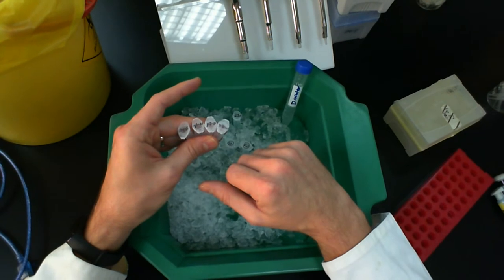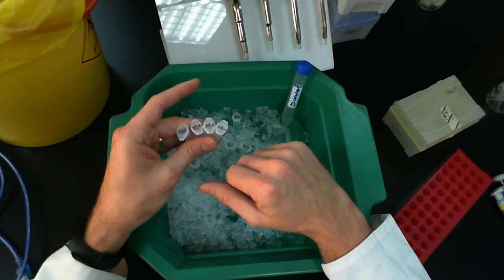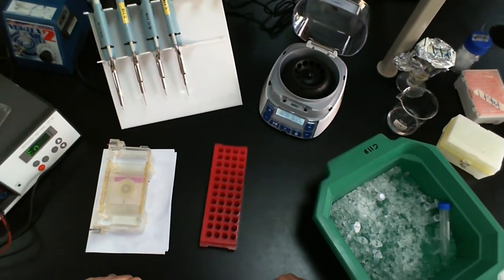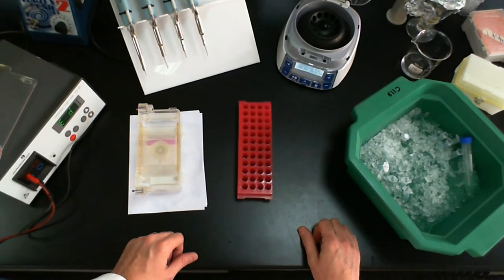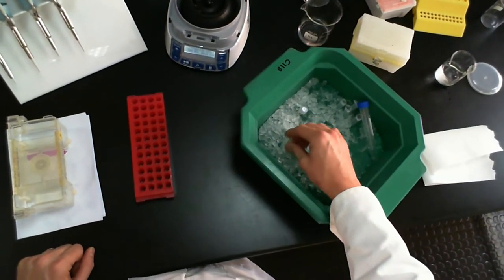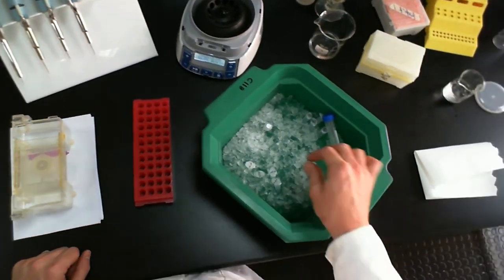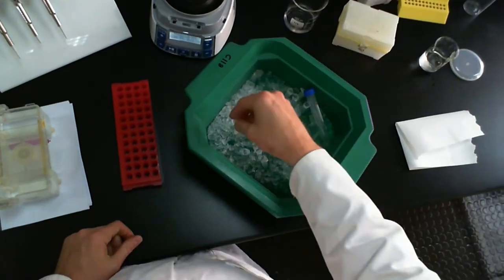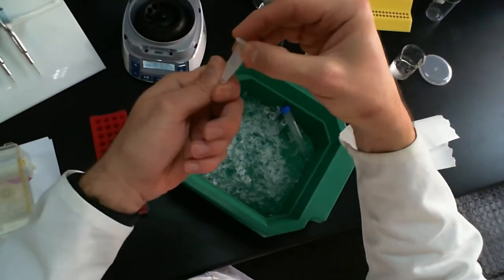Basically, depending on which species the enzyme was extracted and purified from, that enzyme will work best at a particular temperature. So our samples have completed their incubations at 37 degrees Celsius and at 65, so our enzymes have been inactivated. Now, when I was taking them out of the water bath, I immediately put them into an ice bath or your ice bucket.